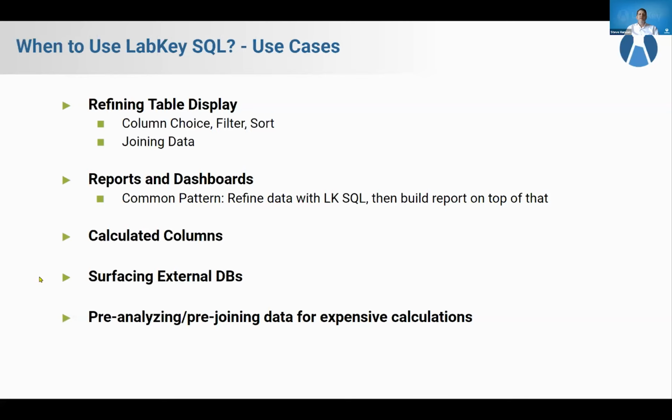Second, LabKey SQL is a great foundation for building reports and dashboards. What I mean by this is it's a really common practice to first refine your grid display, your table display, using LabKey SQL. So you use LabKey SQL to get the relevant data, and then you pass that data to your report mechanism, whether it's a graphical report or some kind of aggregating report. That's a really powerful pattern to use in the server. We recommend that you pass the data through those transformations to build an effective report, and then ultimately multiple reports inside of a dashboard.